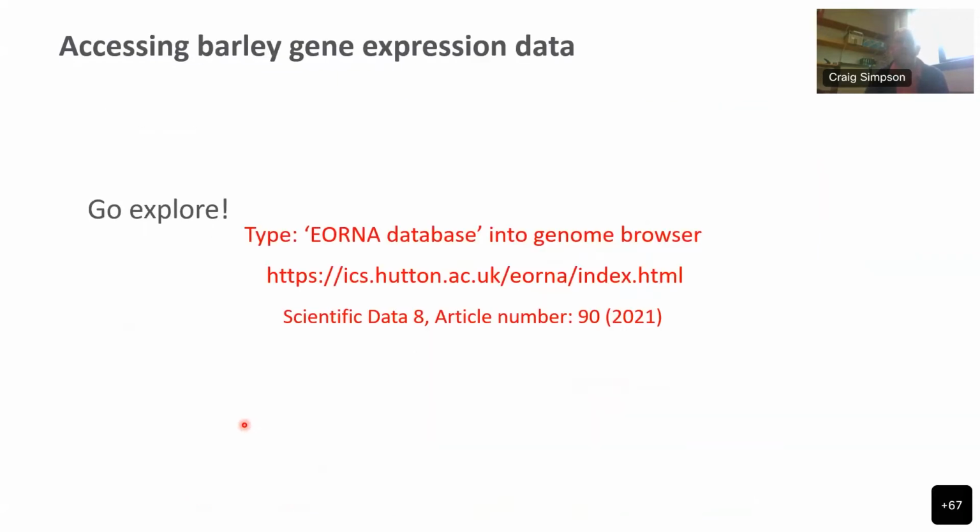So how do we access EoRNA? If you go into your browser and just type in EoRNA database, you will then go to this site here, and that gives you the front page, and you can go from there. I thought I would do one thing to highlight how quickly and easily you can generate information and data and set up your stories, or projects, or whatever you're interested in.